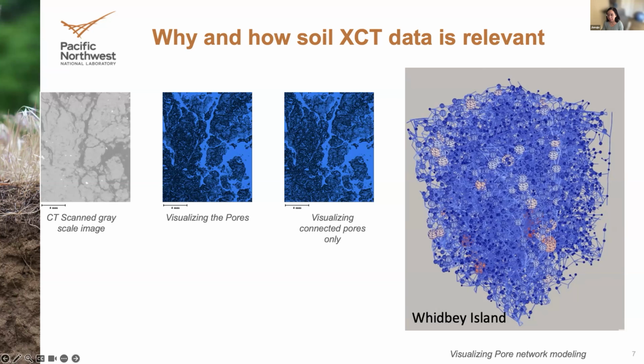In particular, he mentioned these spreadsheets where they report the geometry of the network, and also very detailed information on the soil pore distribution, pore throats, and connectivity.